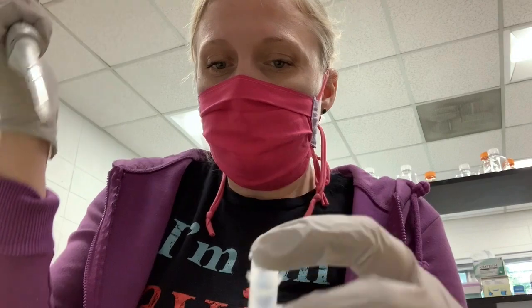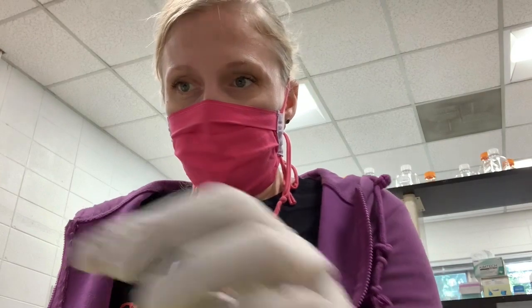These columns are made so that the DNA will bind to the filter. It's made of a material that will bind to DNA in the presence of this DNA binding buffer. The DNA will be stuck to that filter during the binding buffer step and also the wash buffer step. And then at the end, we're going to elute the DNA, and the water will cause the DNA to come off of that filter and go into the tube. So I've done 2 of these. I'm going to hit pause while I finish them and then come back.